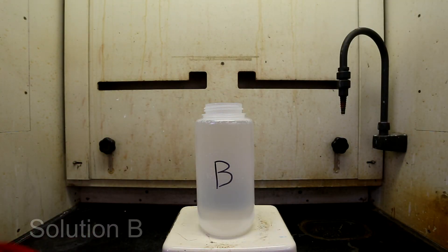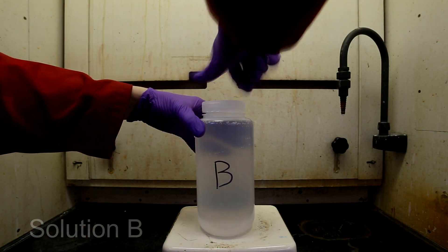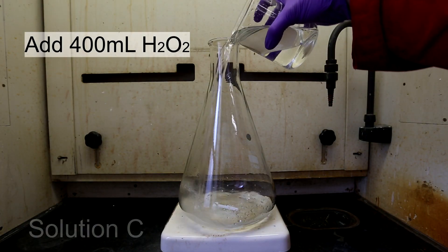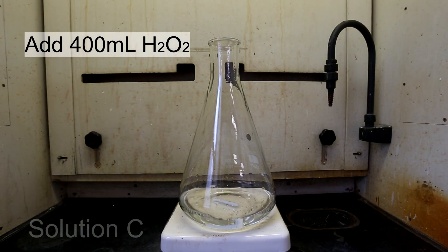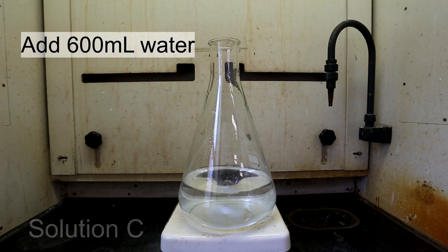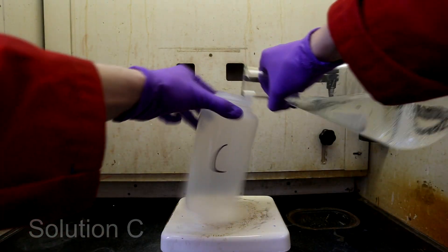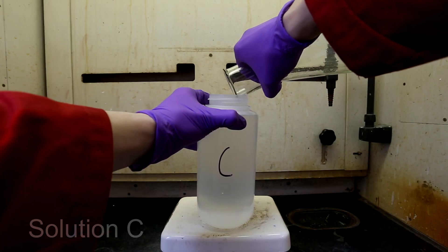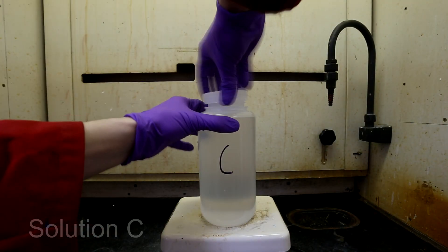Now, put this solution aside and we'll move on to making the last and easiest one. First, add 400 milliliters of 30% hydrogen peroxide. Top this off to 1 liter using about 600 milliliters of water. Mix it thoroughly and then add it to a container labeled C. Now that all the solutions have been made, we are ready to move on to the demonstration.